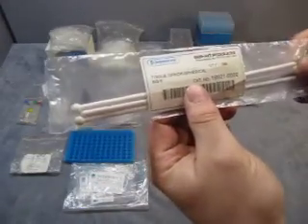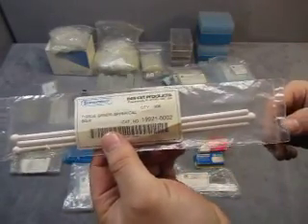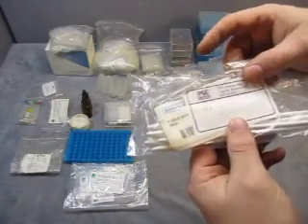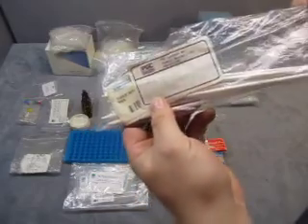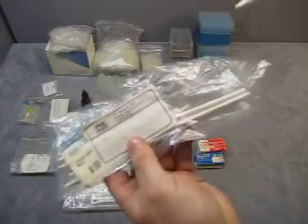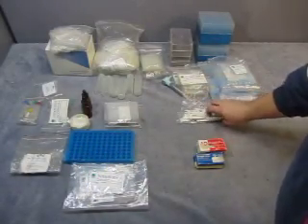And there's a tissue grinder, spherical — so you get that. It's a tissue grinder. And then you get another tissue grinder that's kind of rounded. It opens up. So you can grind some tissue with that — what everybody wants to do on a Friday night.